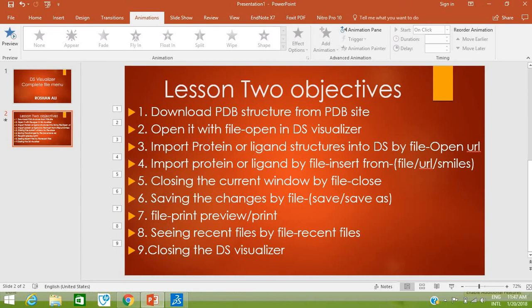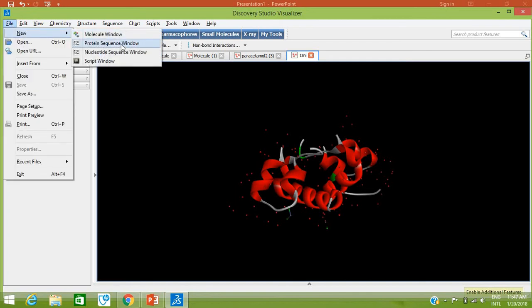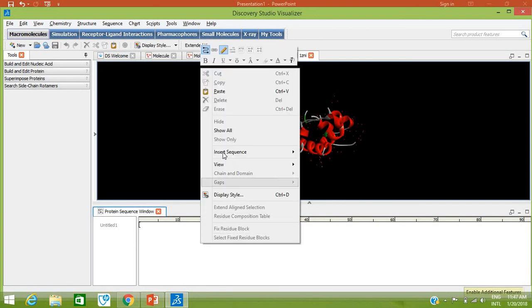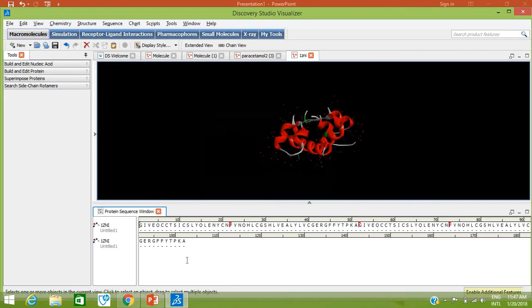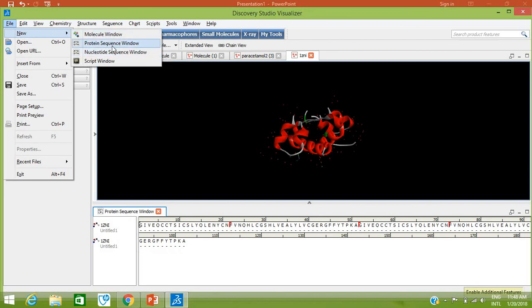Our last objective is how to close DS Visualizer, but before that I'll mention a few other things we left in the File menu: Protein Sequence Window, Script Window, and Nucleotide Sequence Window. Since this is a protein, go to File > New > Protein Sequence Window. To see the sequence of the opened protein structure, right-click, select Insert Sequence From Window, choose the molecule 1ZNI, and click OK. This shows the sequence of the opened protein structure. The Nucleotide Sequence Window would be used if we had a DNA structure.